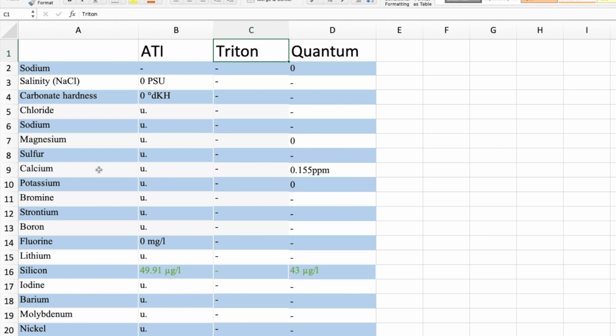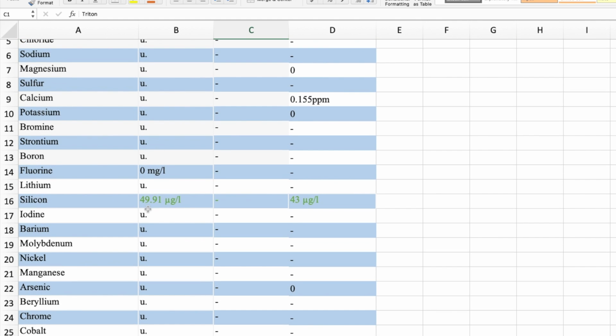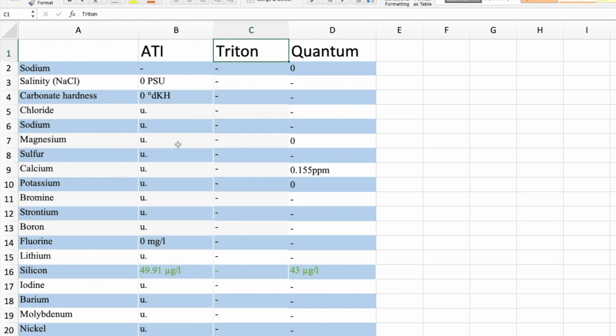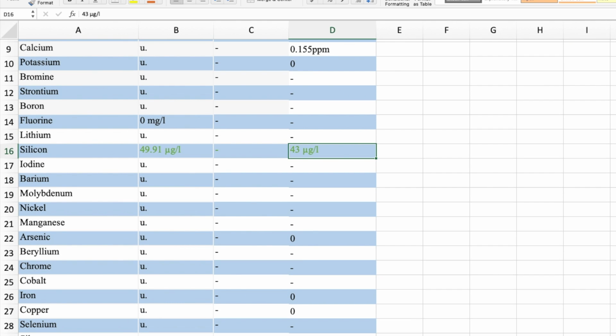I'll scroll across so we can see all of the elements here. Effectively, I've given a couple of points for the two that did do RODI testing because they did pick up a couple of things in my water and they were pretty well matched. You could see Quantum picked up a little bit of calcium, but 0.1 of a ppm isn't anything to write home about. They both did pick up decent levels of silicon and pretty comparable values, and they both did pick up pretty comparable values of zinc.